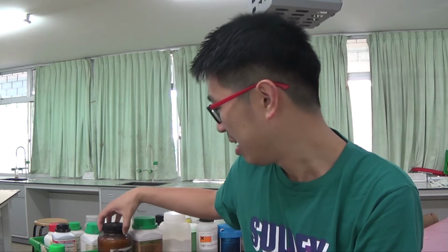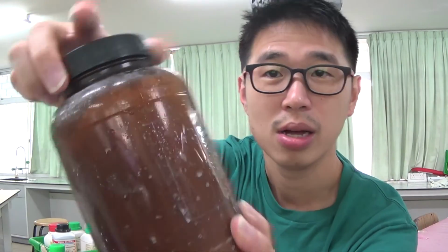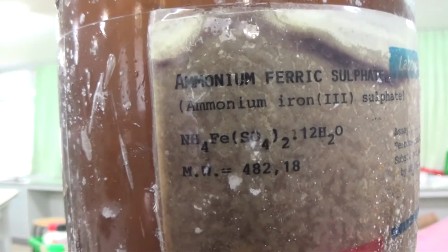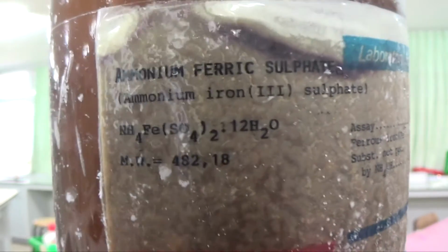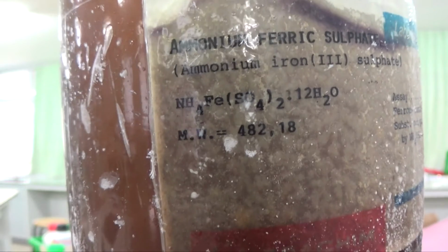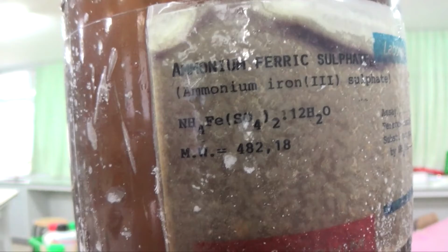There's another one. This bottle looks disgusting. It's a really old bottle. Not sure how clear it is, but I'll just move close to the screen. I hope you can see it's ammonium iron 3 sulfate, and it's also hydrated. They don't say it's hydrated, but look at the formula at the bottom. NH4 plus, Fe3 plus, okay?